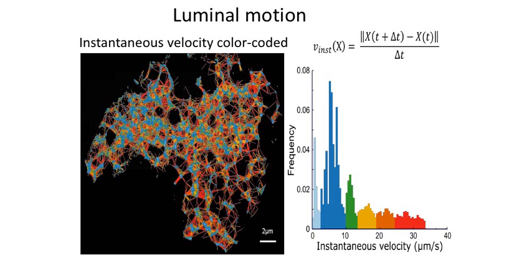So to answer this question, in part 1, we have already discussed that we can use many trajectories. So let me remind you that we have inside, for example, the network here, these tubules, and we follow trajectories.